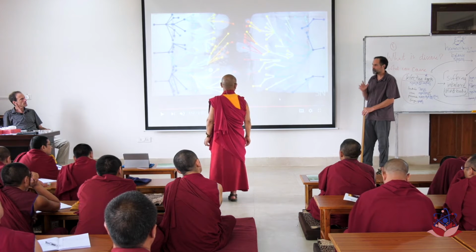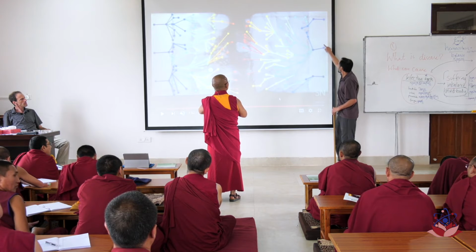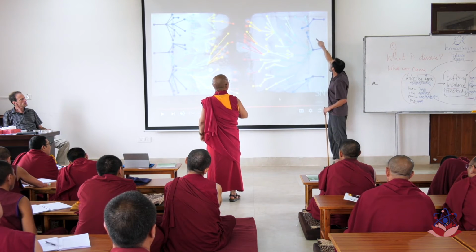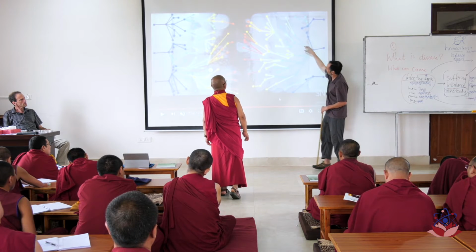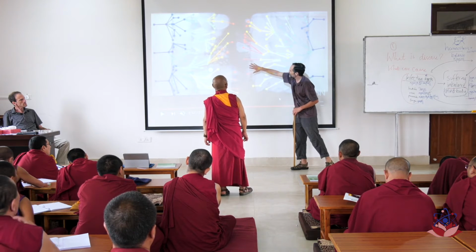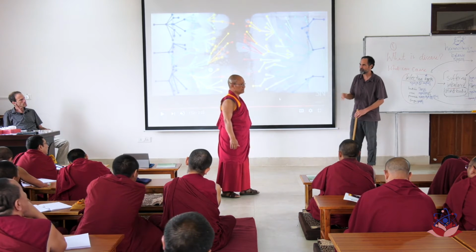Okay, so tomorrow, tell me why you think these bacteria grow piled up. Why do they grow piled up here, and you don't really see them piled up over here? What's the difference? Think about that tonight. Let's talk about that tomorrow.